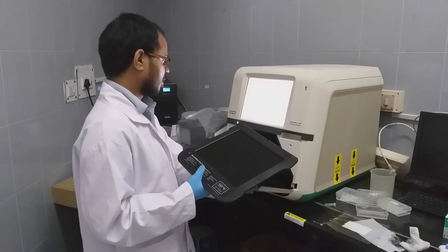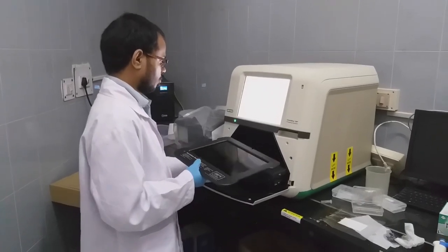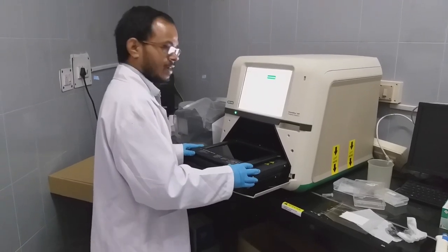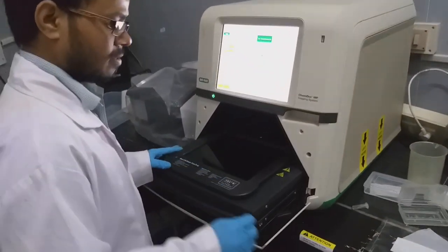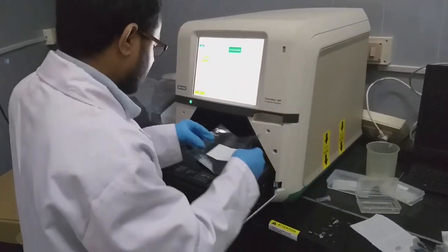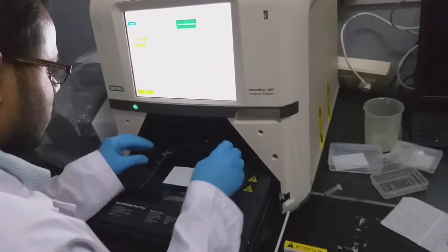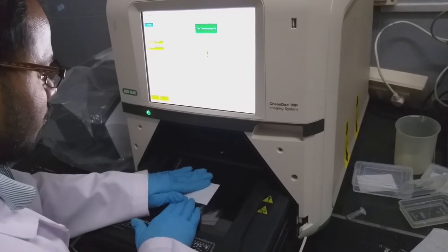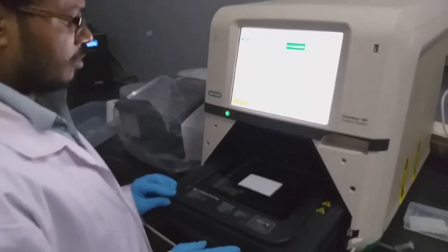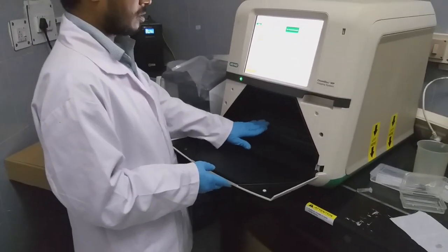So we have to open the system properly, align the tray and then shift the blot to the tray. Once it is over, you just close it.